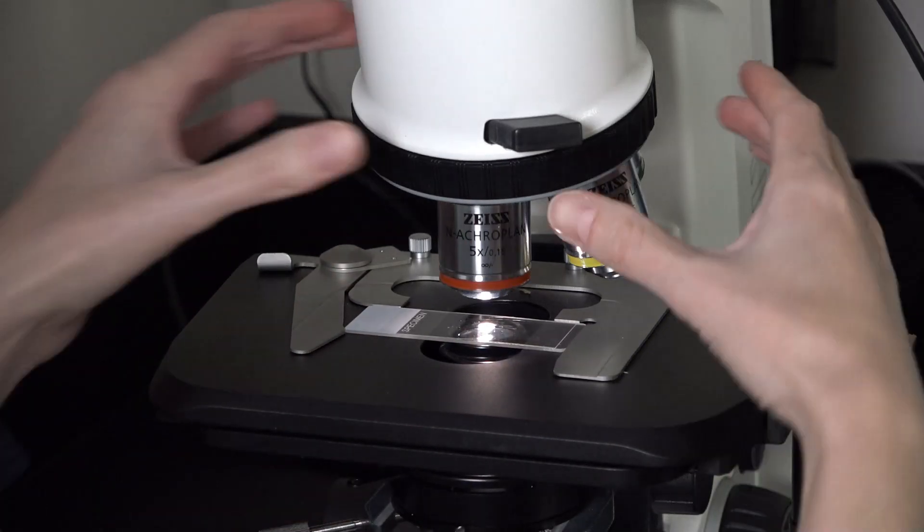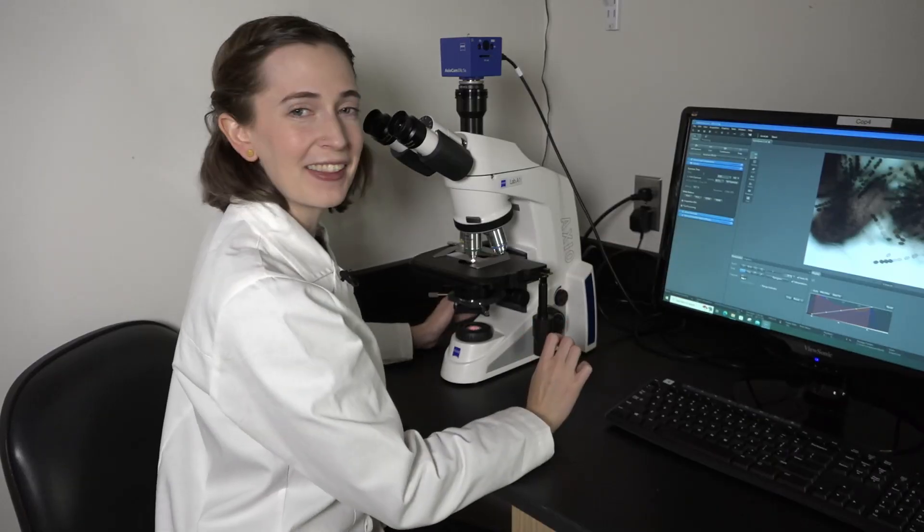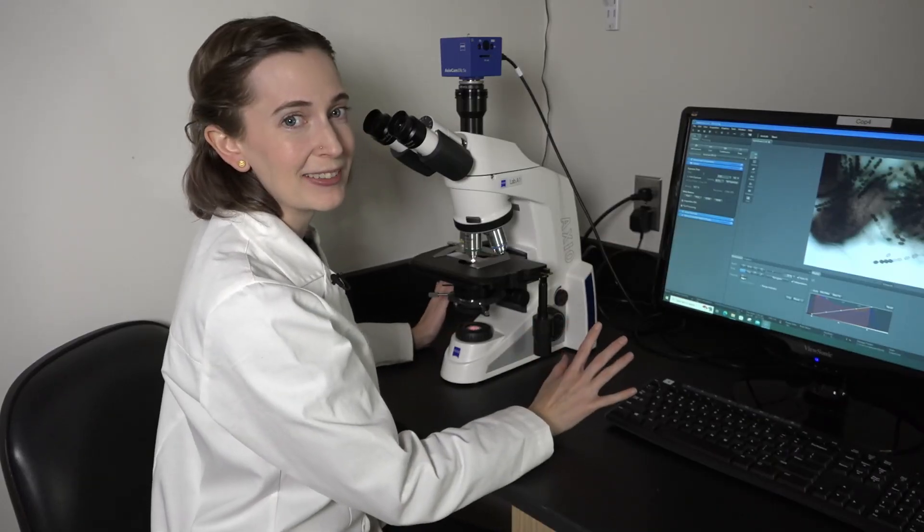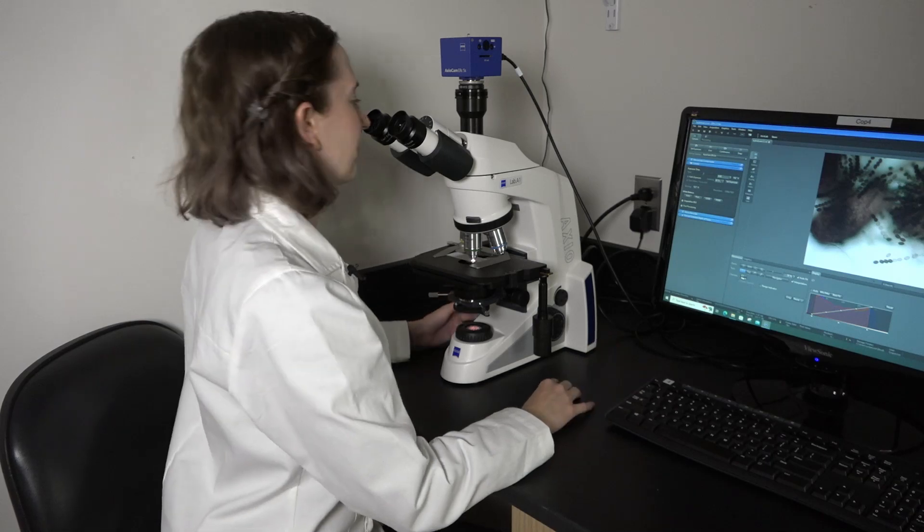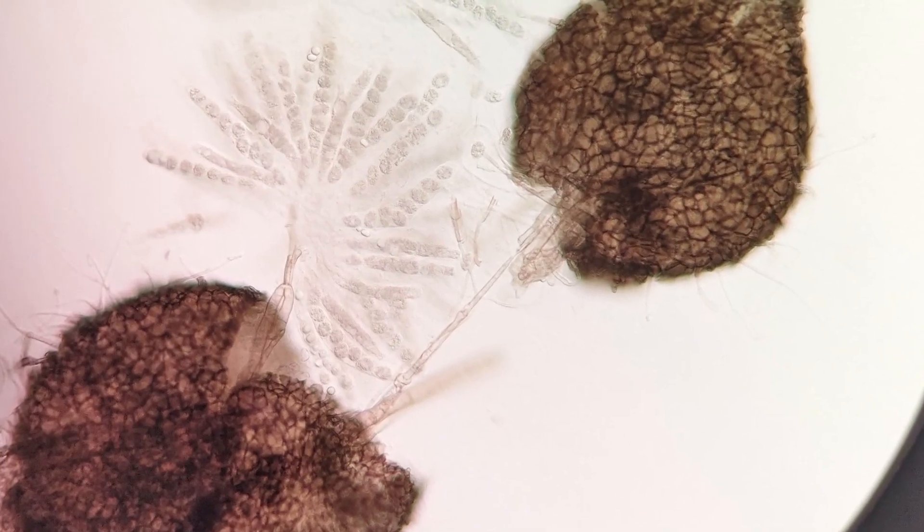Sordaria spores are very small, so I'll need a magnification of around 10 or 20x. Oh, look at all the little asci! Let's find ones that'll be ideal for the experiment. First, avoid asci that are so pale you can't tell if they're tan or black. They're not mature enough to be showing the color trait, so we can't use them.